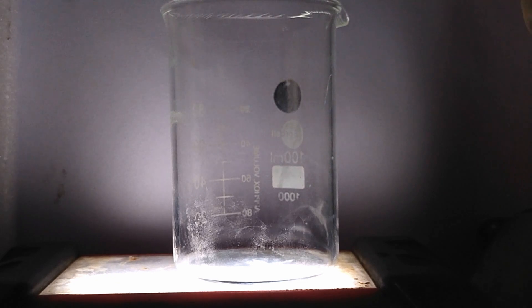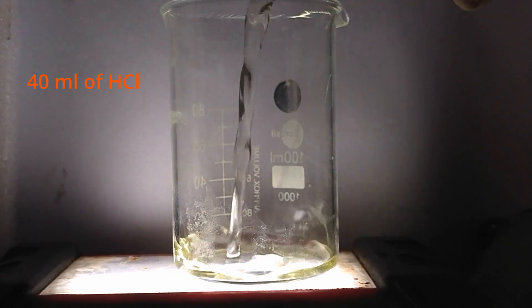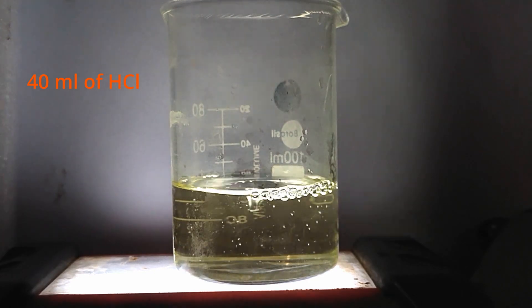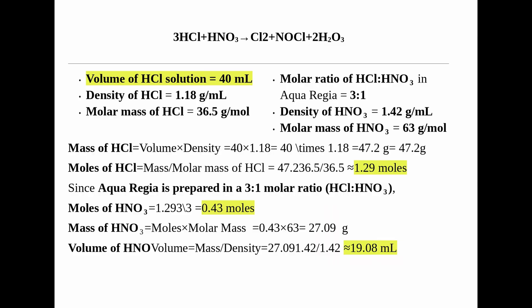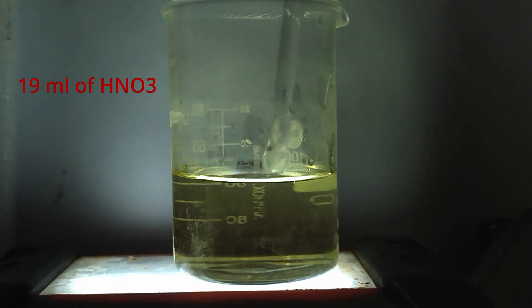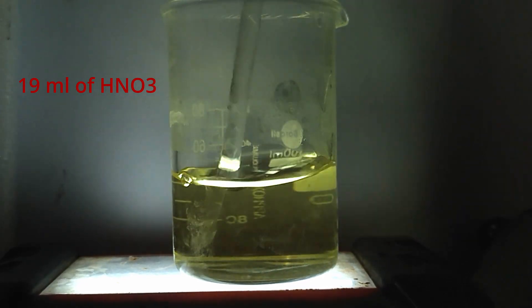To prepare aqua regia, I took 40 ml of hydrochloric acid. It needs a 3 by 1 molar ratio of HCl to HNO3. Since 40 ml of HCl contains 1.29 mols, we need one third of that, which is 0.43 mols of nitric acid. That means 19 ml of HNO3 is required to maintain the right proportion. I am adding the nitric acid in small portions while stirring. This prevents excessive fume release and ensures a proper reaction.